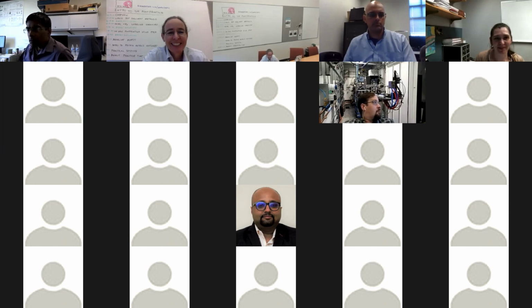Anyone want to? I think if you do normalization, your sample loading will not matter. That is correct, right? It will if you have a difference of, let's say, 10-fold. You would see that the fraction of modified and unmodified would be affected, because of simple dynamic range in mass spectrometry. You have low abundant species versus high abundant.